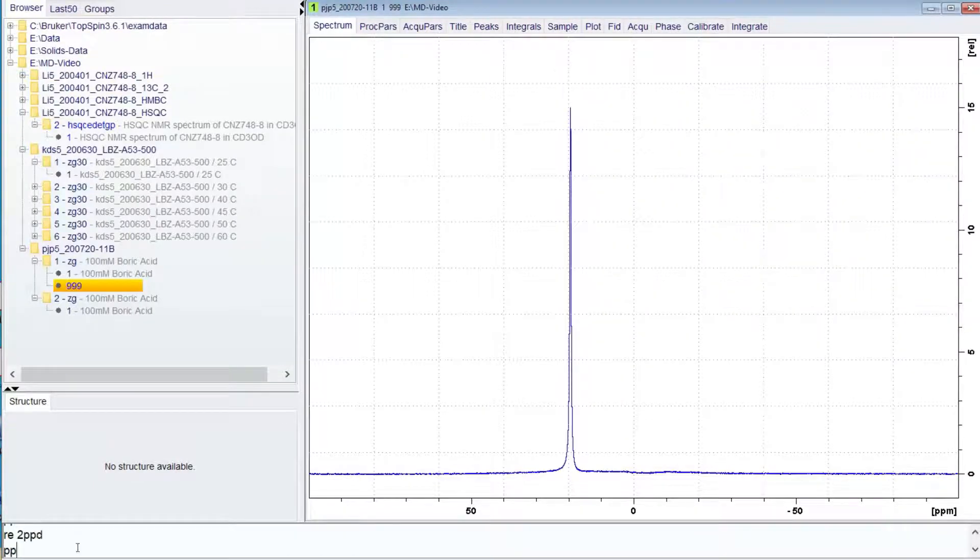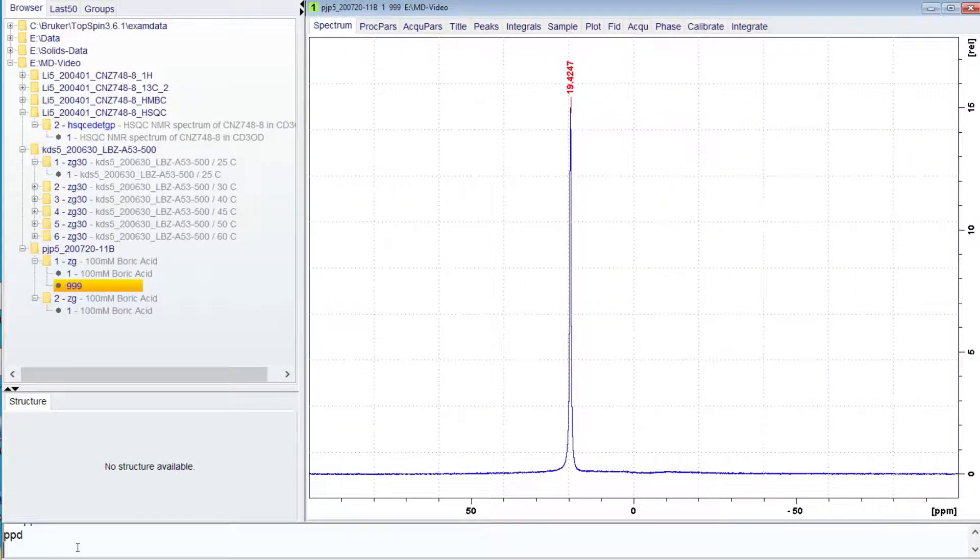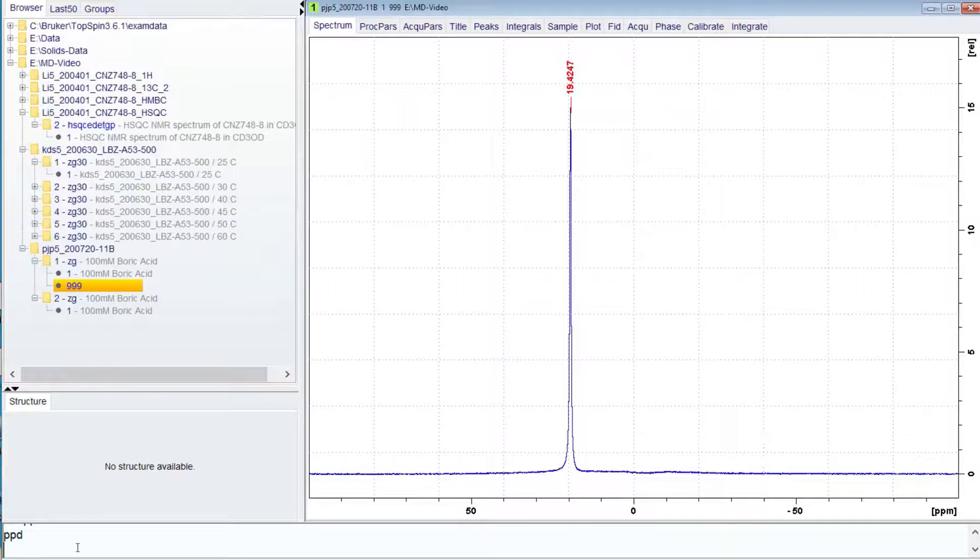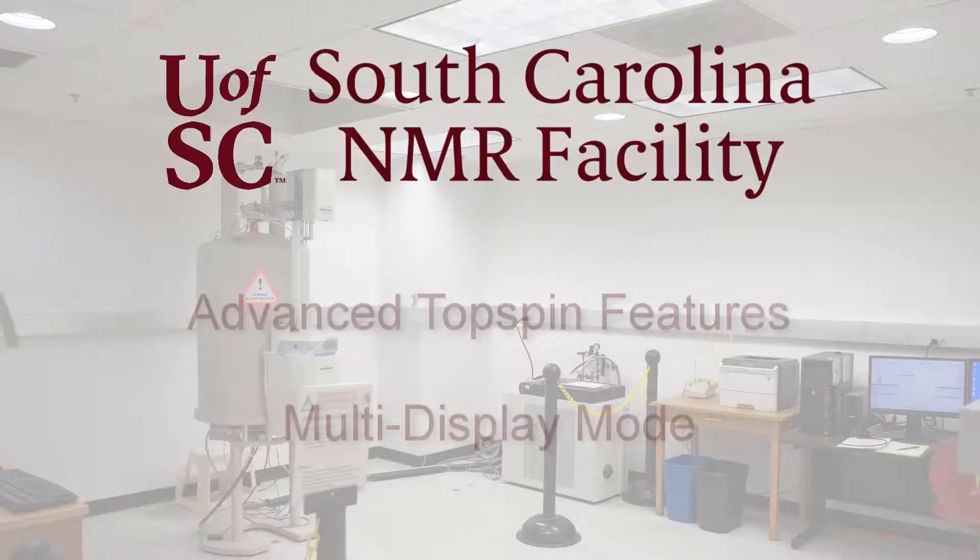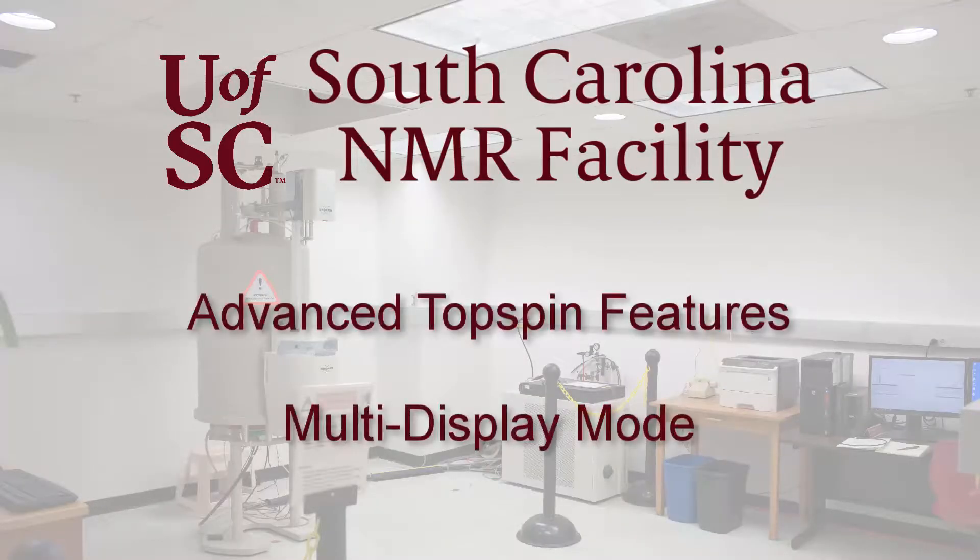These are some of the operations you can perform with multi-display mode. Please let us know if you have any questions about multi-display mode or if you have any suggestions for further videos.